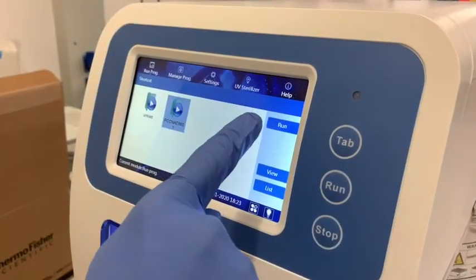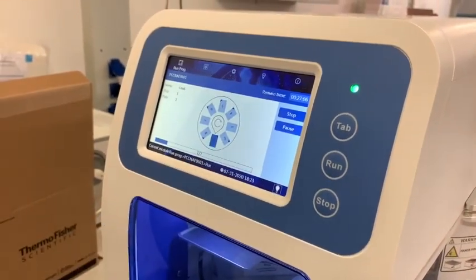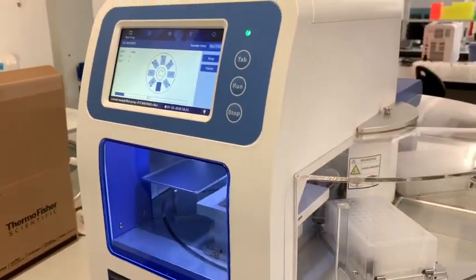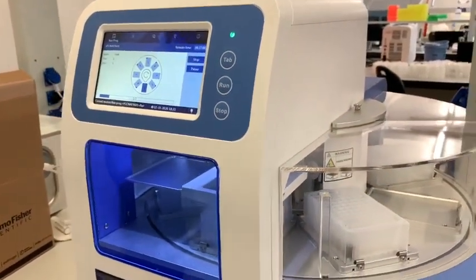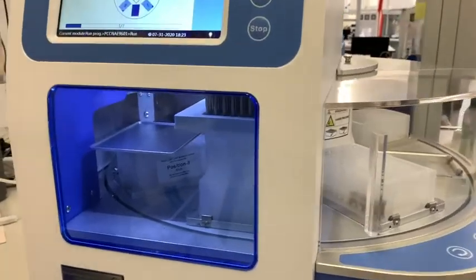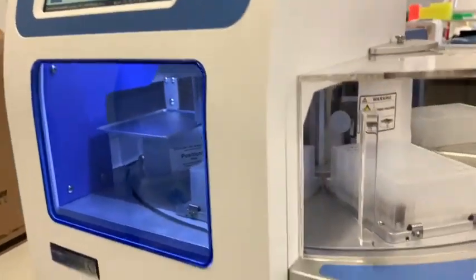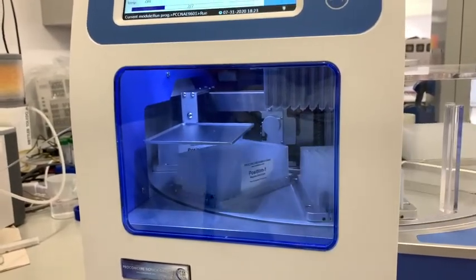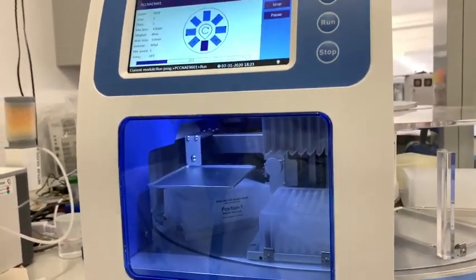You will receive the extractor with our software already installed for the run. Once you click on Run, sit down and relax while the extractor does its job. As you can observe, it is beginning to mix the sample, and after the mixing, the magnetic beads will be attached to the plastic and transferred from plate to plate.